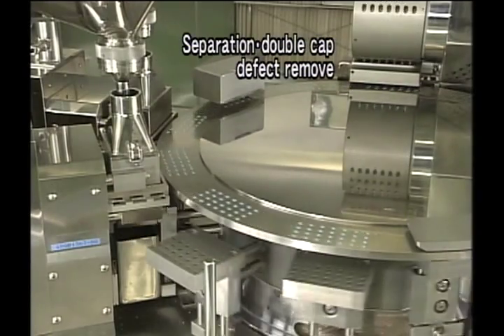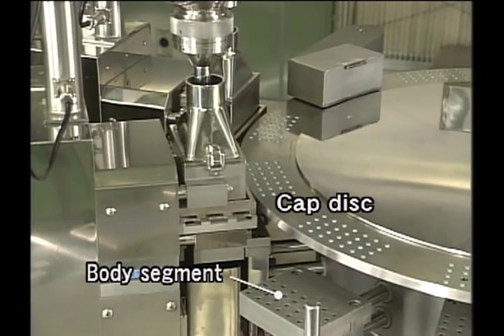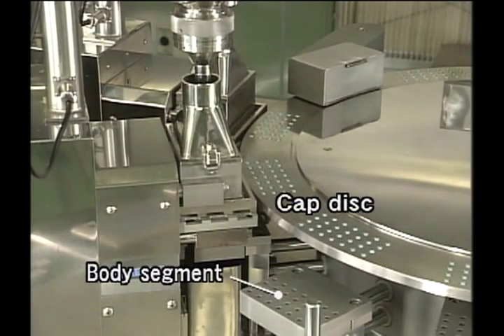Defective capsules such as unseparated capsules and double caps are automatically eliminated during operation to avoid mixing empty capsules with filled capsules.